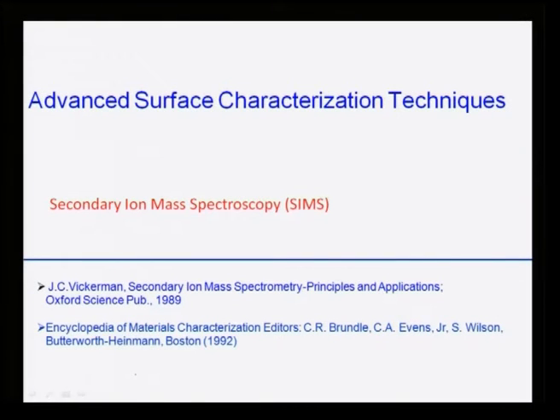So we have been discussing different advanced surface characterization techniques for the last 4 or 5, and more like 7, lectures. The last technique which I am going to discuss in detail is known as secondary ion mass spectroscopy. In the literature it is always written as SIMS, the acronym for secondary ion mass spectroscopy.